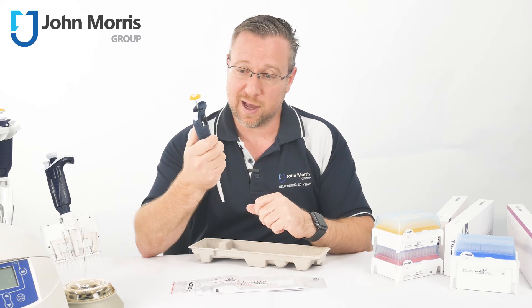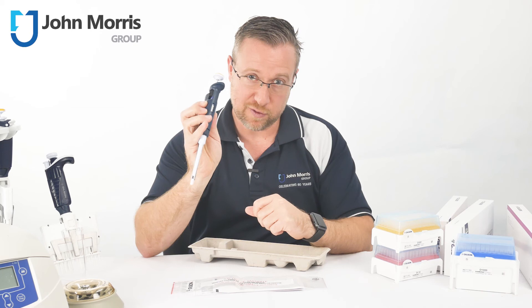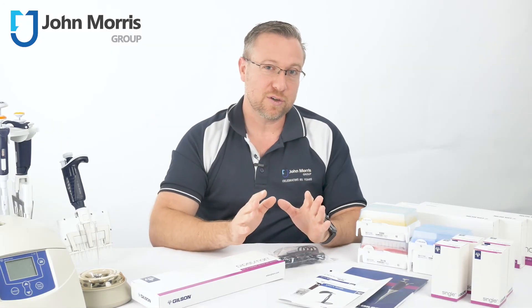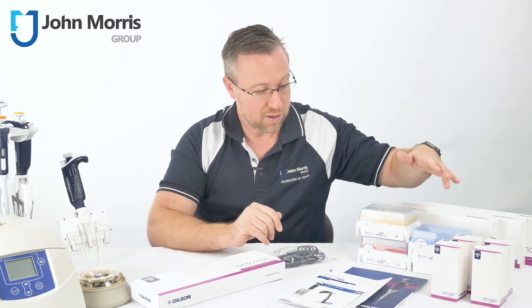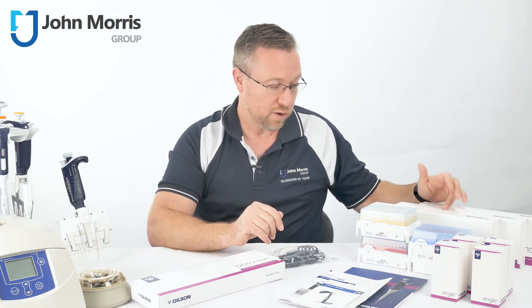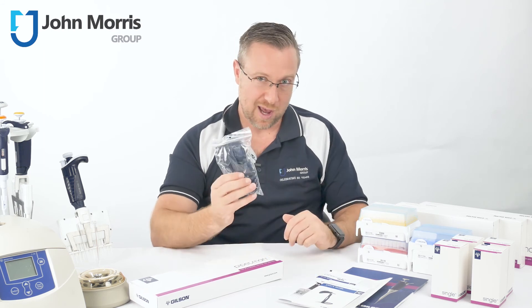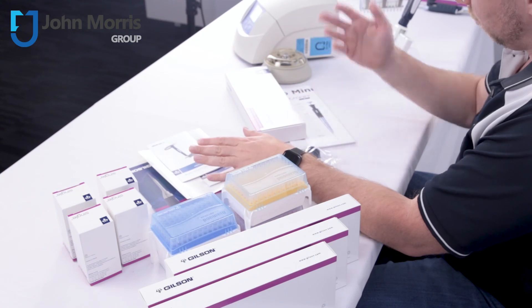Of course, whilst we don't advise it, these pipettes are very likely to survive if you drop them off a bench — one of the reasons they're brilliant for students or people who want their pipettes to last 15 to 30 years. So there you have it: the G series four pipette kit from Gilson. You get the four single hangers, the three boxes of tips, and the four different pipettes — the 2, 20, 200, and 1000 microliter — plus the handy comfort handles.